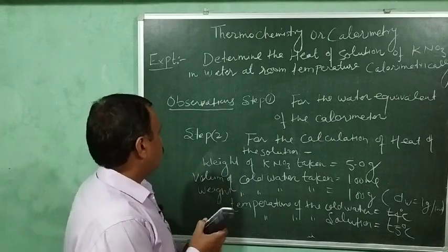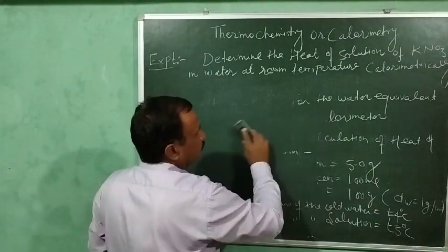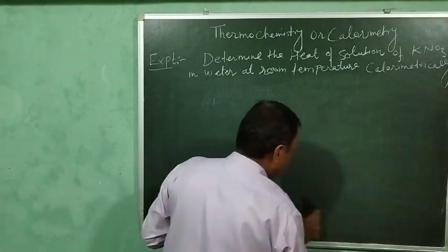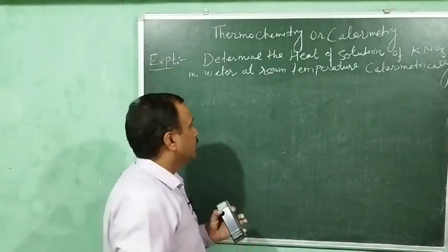Then comes the general calculations, and the general calculations for the water equivalent will remain the same as I explained earlier.